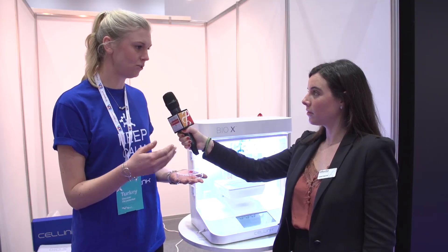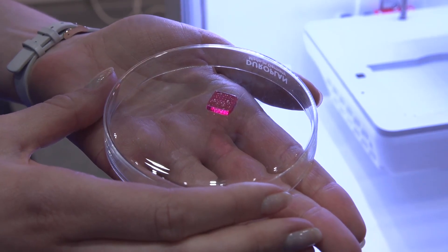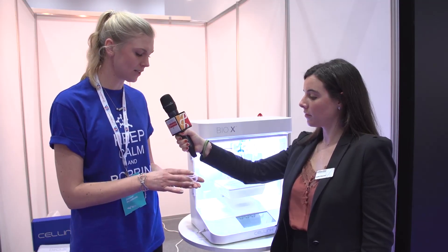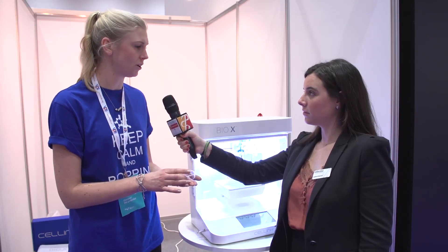And in this case, you can actually add human skin cells — all the different kinds — and try their products, and also for R&D of course. So this is a skin tissue model that they can use for trying their products on.